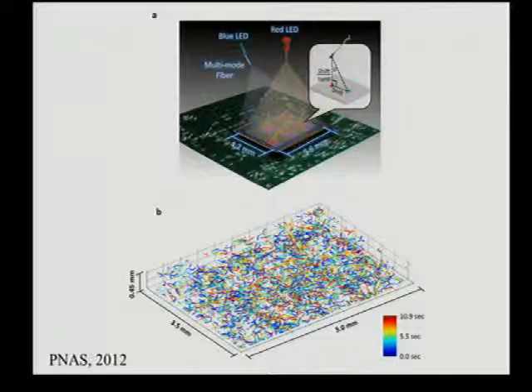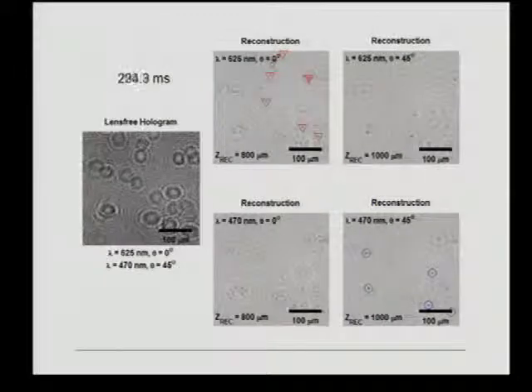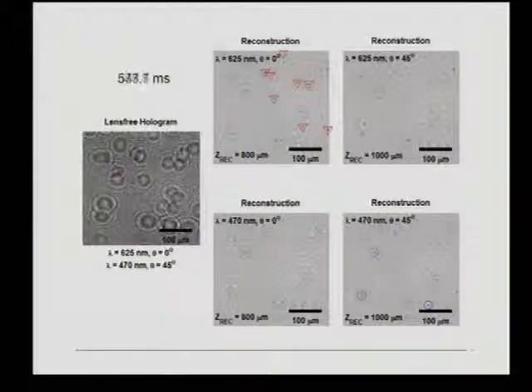As you change the height of a sperm, the separation between the red shadow and the blue shadow will be modulated, and that modulation correlates with delta Z. This is a very nice design to also separate projections that are simultaneously acquired, because blue and red are far apart from each other. So only at the correct angle and wavelength combination can you have contrast.